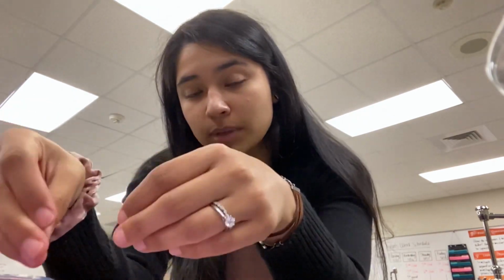We will have 2 different ionic compounds, and I'm not being specific about which of the ionic compounds are in the mixture because the ones that we've learned in this class and studied all pretty much have the same properties. The important thing to look at here is that the 2 ionic compounds we have do dissolve in water. So we'll keep that in mind for later on. And we also have iron filings, and we also have pepper.